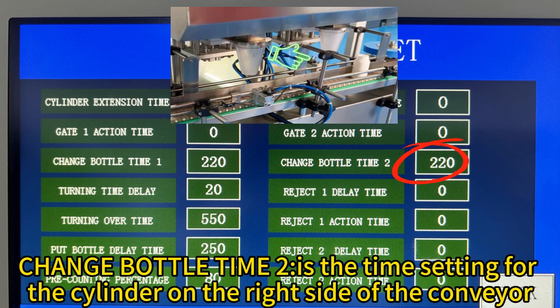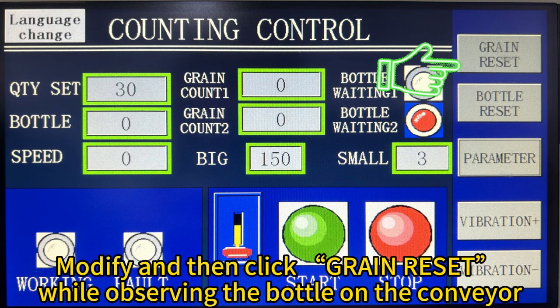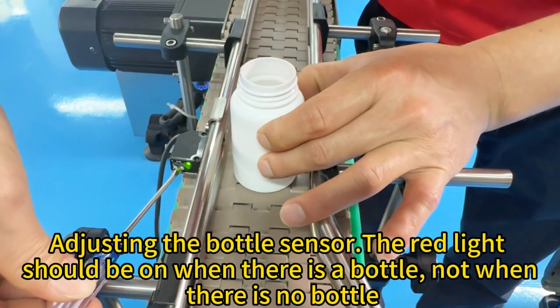Change bottle time R is the time setting for the cylinder on the right side of the conveyor. Cylinder time too fast: increase value. Time too slow: decrease value. Modify and then click green reset while observing the bottle on the conveyor. The bottle passes through smoothly, indicating the completion of the adjustment.